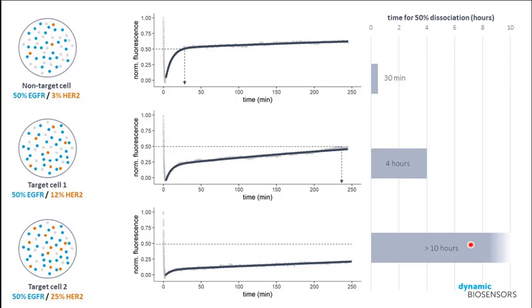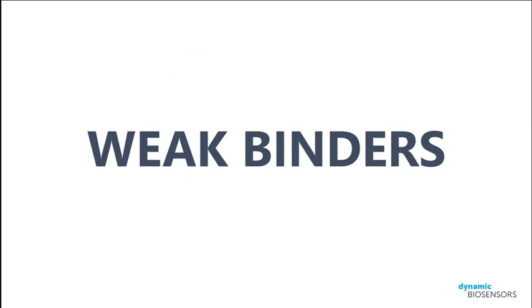So you can see here that with a stronger engagement, we ensure that the bispecific antibody is retained, not only bound to the surface, but held onto the surface, for instance, to initiate any downstream processes that are necessary in the development of therapeutic antibodies, or for them to actually be functional as therapeutics.